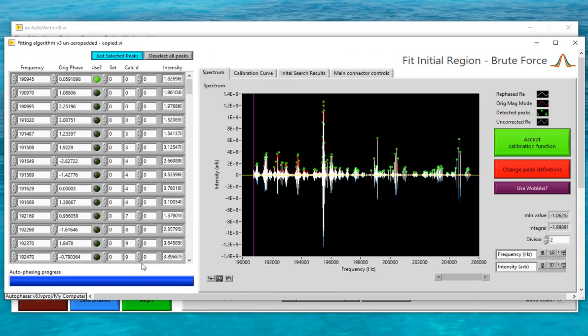Once it knows where the peaks in the spectrum are, Autovectus can suggest an initial region that can be used for brute force fitting. Brute force fitting simply means that Autovectus will iterate through all the possible phase correction functions for a small region and identify the one that it thinks is best. This brute force fitting screen gives the user a lot of opportunity to unpick problems with solving the phase correction function, but this is only really needed for unusually difficult spectra. In the vast majority of cases Autovectus will select the correct brute force fitting region and correctly identify the phase correction function for it.